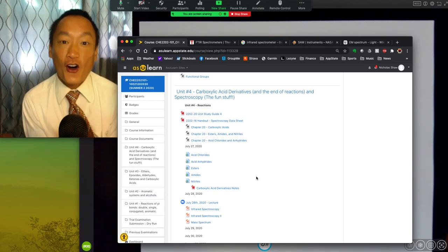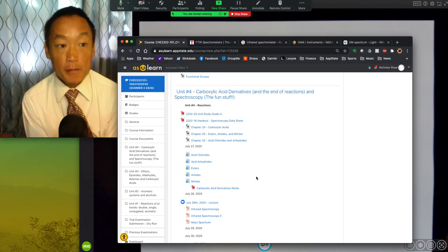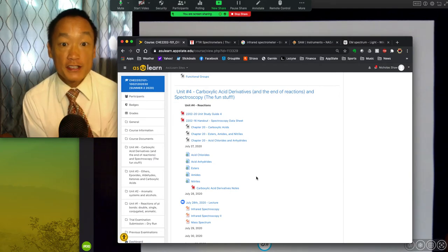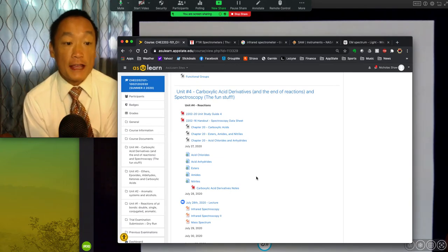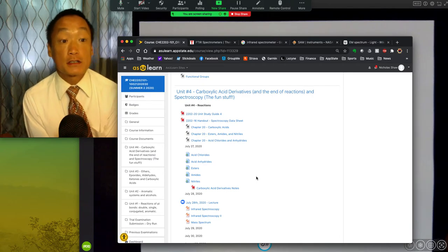Of all the things that I've done with respect to these reactions, I have left out the most major question. You should be asking the fundamental question of, how does he even know what he's told us? If a reaction has Markovnikov addition, how do they know that Markovnikov addition occurred? What type of instrumentation, what type of techniques did they have to identify the molecule that they made? We are going to be giving you the skills that you need to take a look at those things. And this is my favorite stuff to teach.